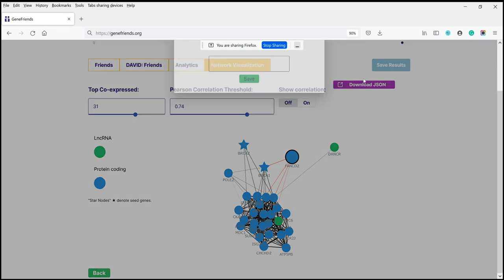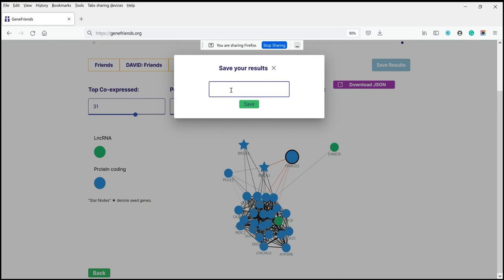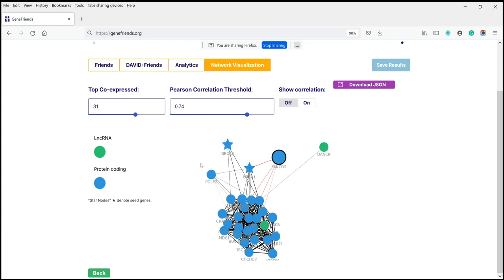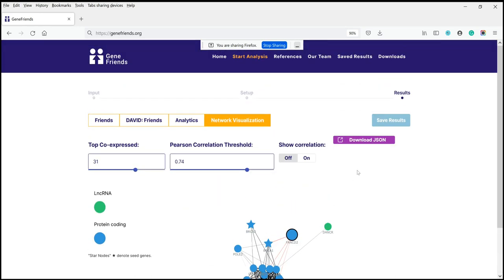You can also save the results. Let's give it a name — BRCA genes — and save them for later if we want to do further analysis. This gives you the main results, and you can download all of the results and the network for further analysis.